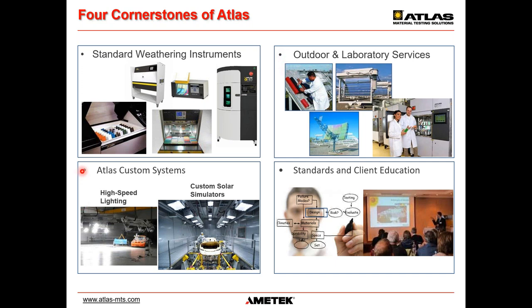Bottom left, you see the Atlas has a special department for customized systems. It's really a dedicated team. One is producing high-speed lighting for crash test photographers, and another more closely related to weathering is custom solar simulators in kind of mid-size to extra large size. A typical application is metal halide-based solar simulators inside a complete drive-in test chamber. So the automotive industry does a lot of testing inside component test chambers, product test chambers, or full vehicle test chambers.